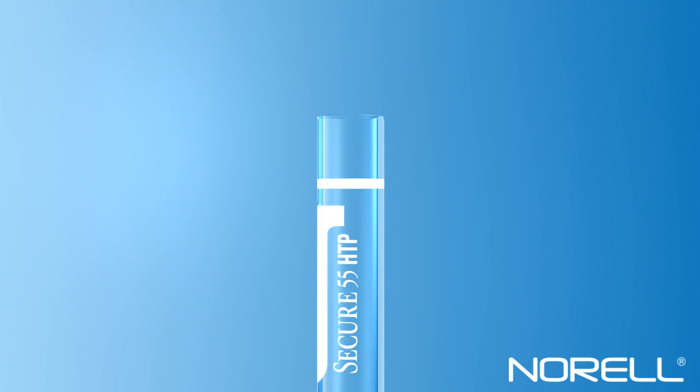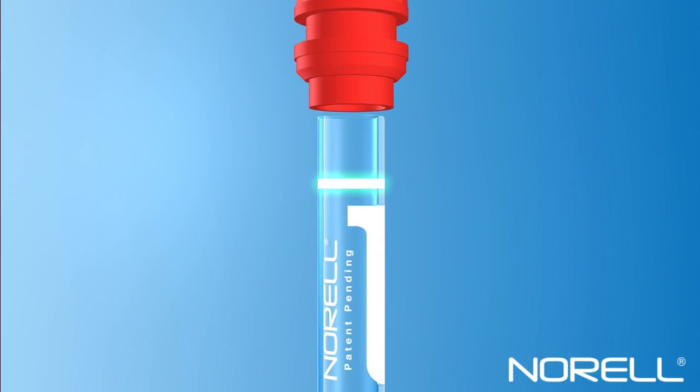The Norell Secure Series NMR sample tube uses a security band that engages and locks into the Norlock 2 security cap, securely joining the cap to the NMR tube.